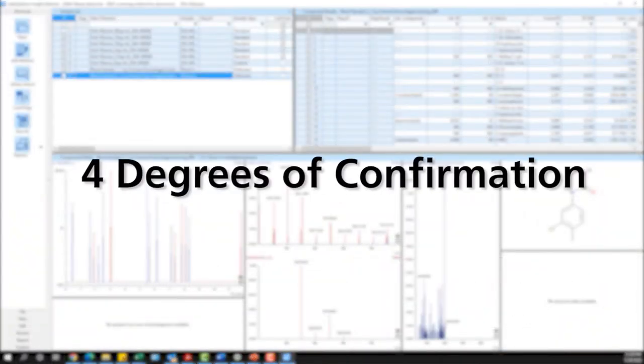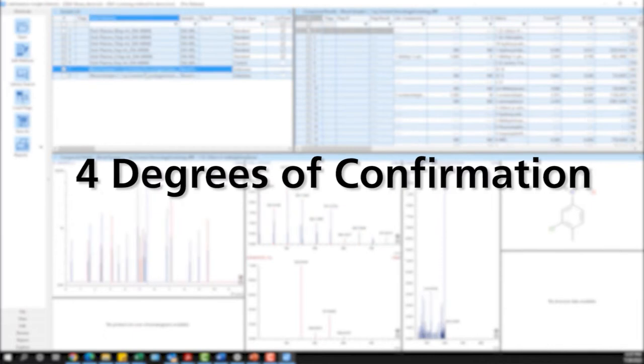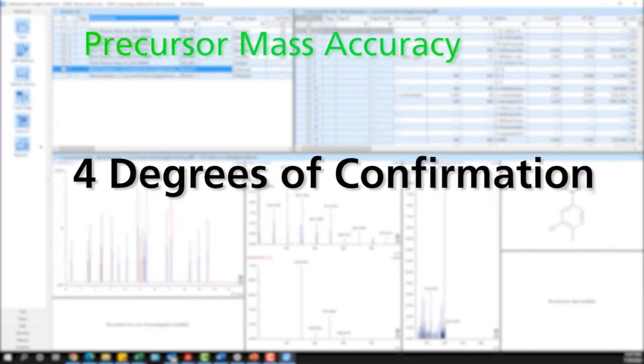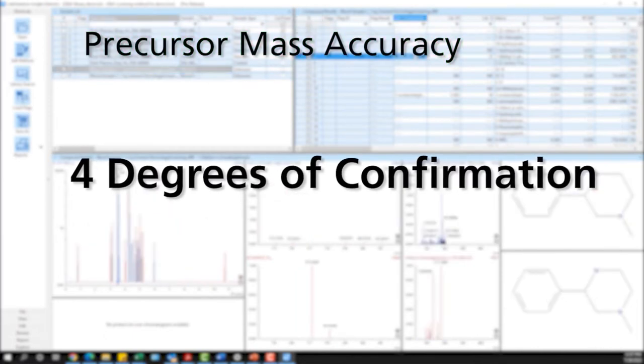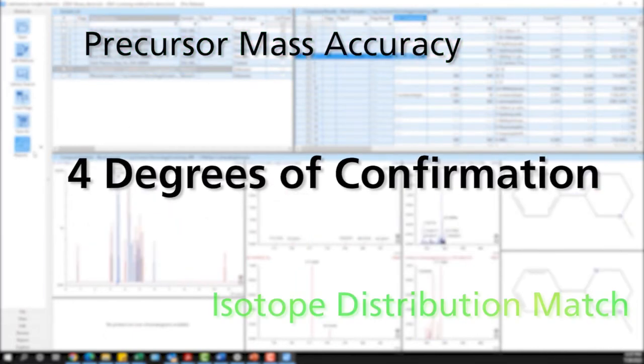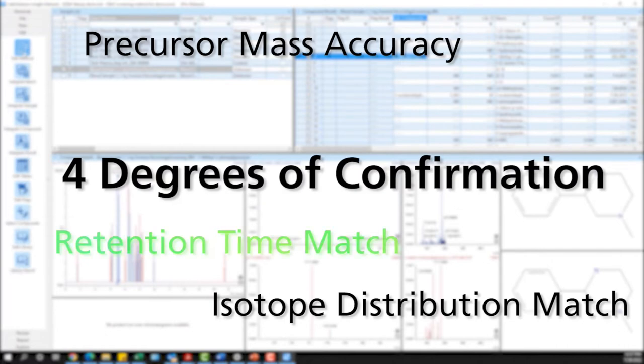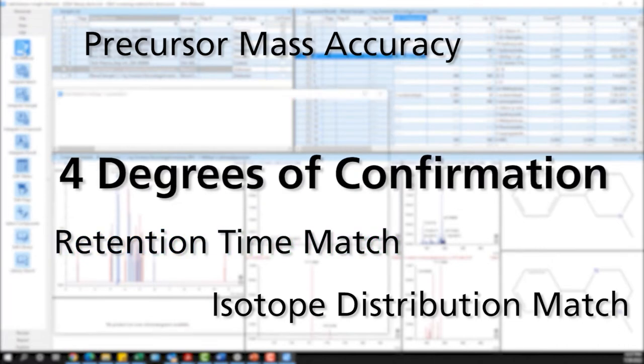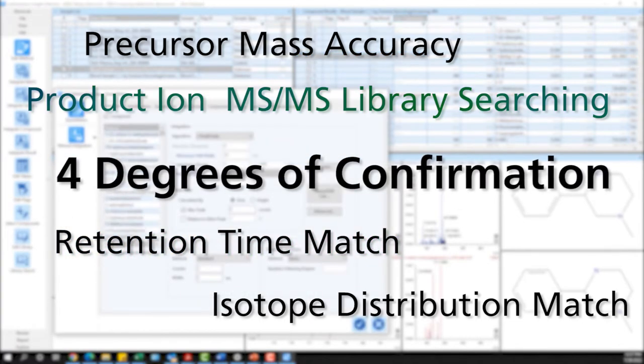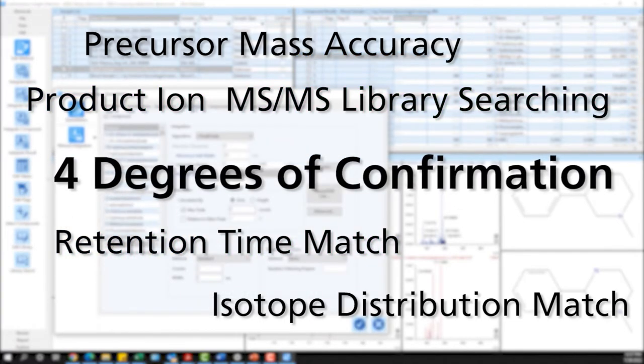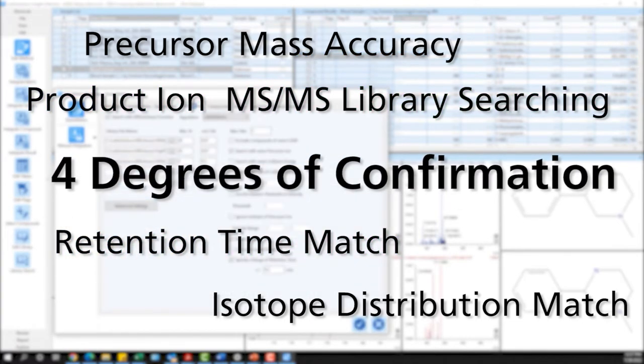This workflow can include up to four degrees of confirmation. These include precursor mass accuracy, isotope distribution match, retention time match, and product ion MSMS library searching.